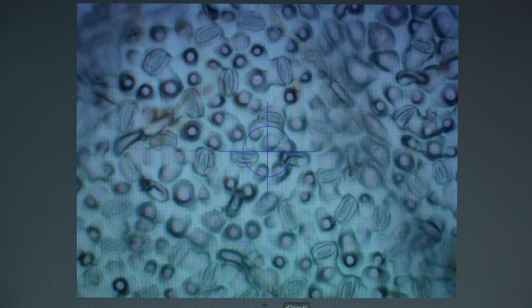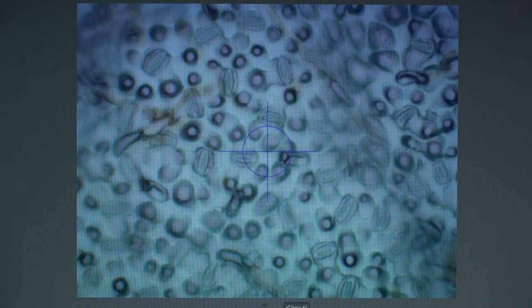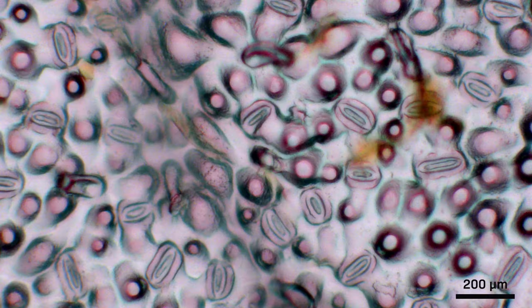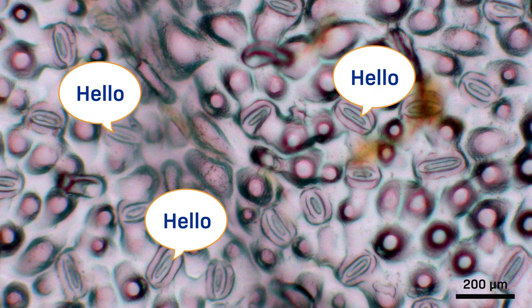Oh my gosh, look at all the stomata, look at all the mouths. Wow, way to go oak leaf. We're seeing lots of bumpy leaf cells and some bubbles, and scattered among them are tons of mouth-shaped stomata.